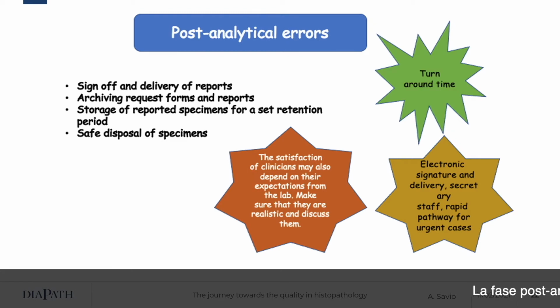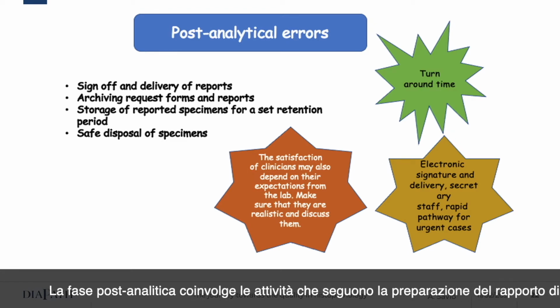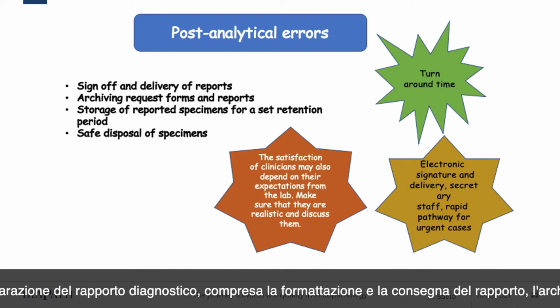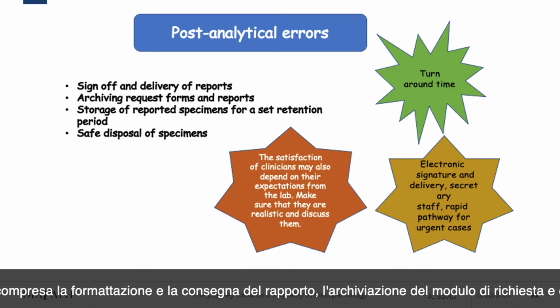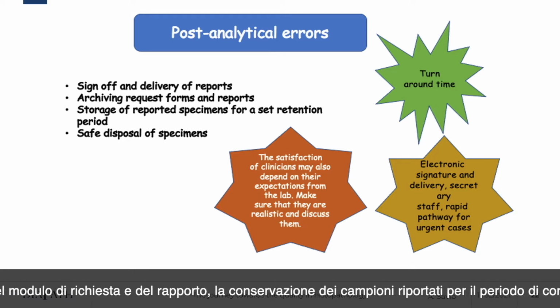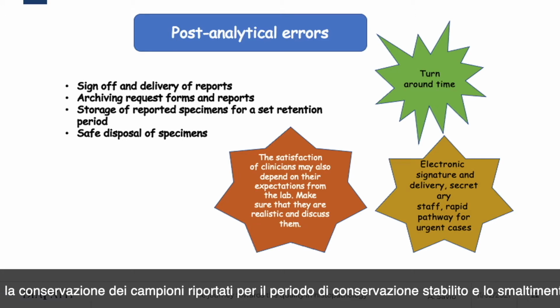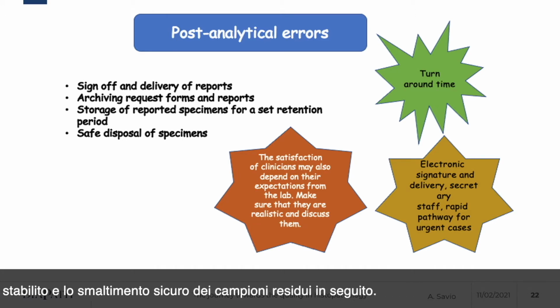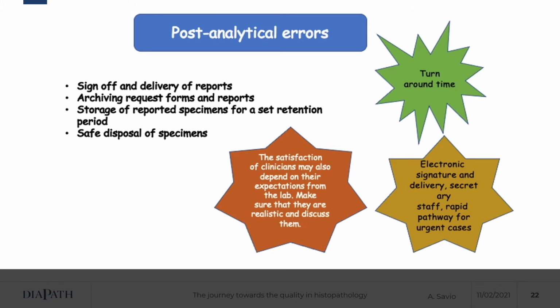The post-analytical phase involves the activities that follow the preparation of the diagnostic report, including checking and amending typographical errors, formatting and delivery of the report, archiving of request forms and reports, storage of the reported specimens for set retention period, and safe disposal of residual specimens thereafter.